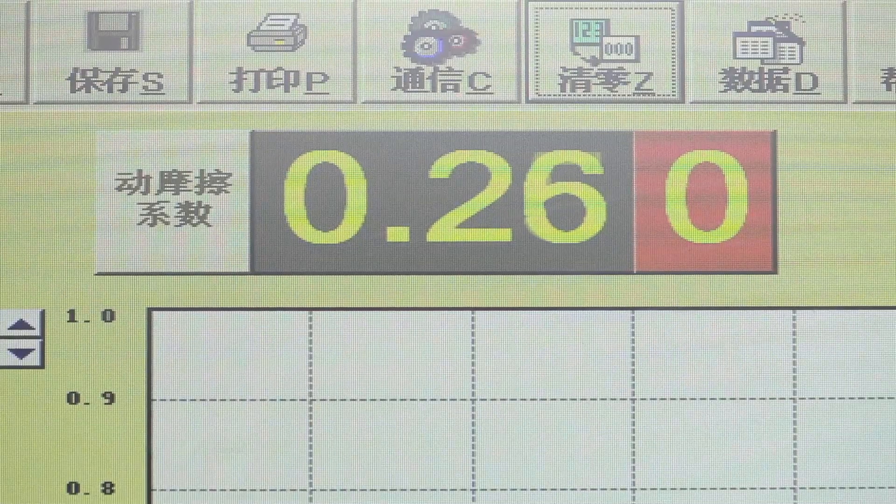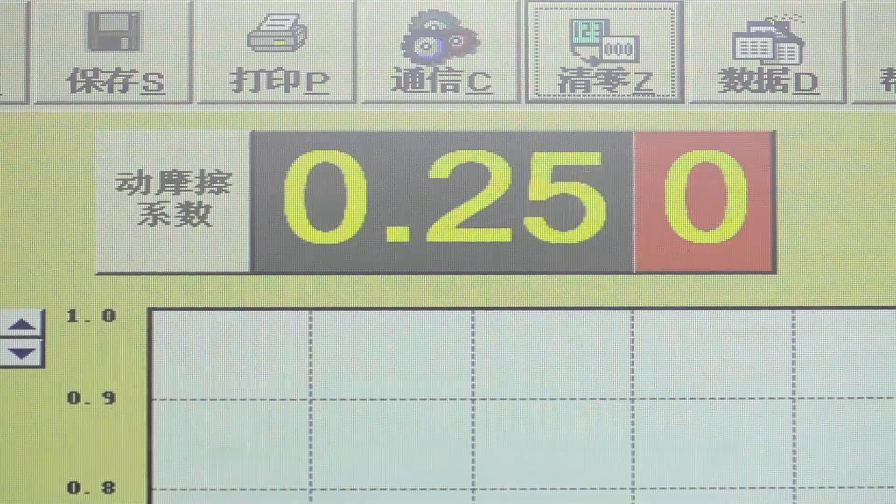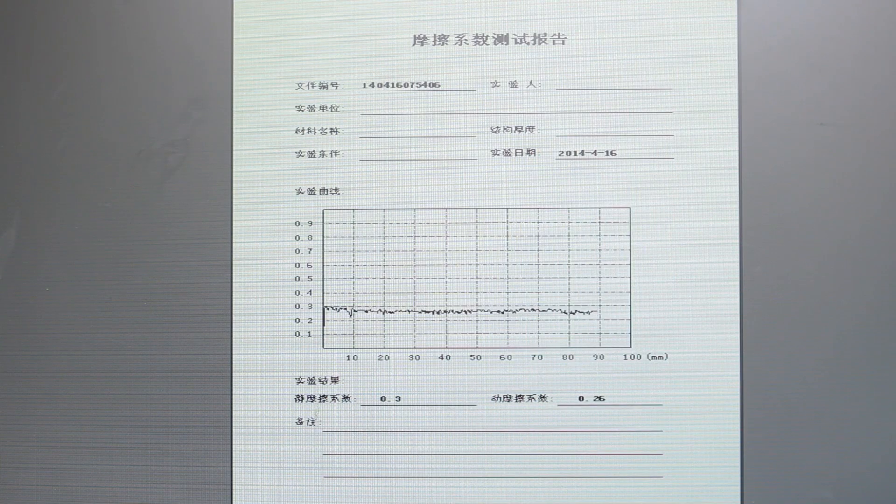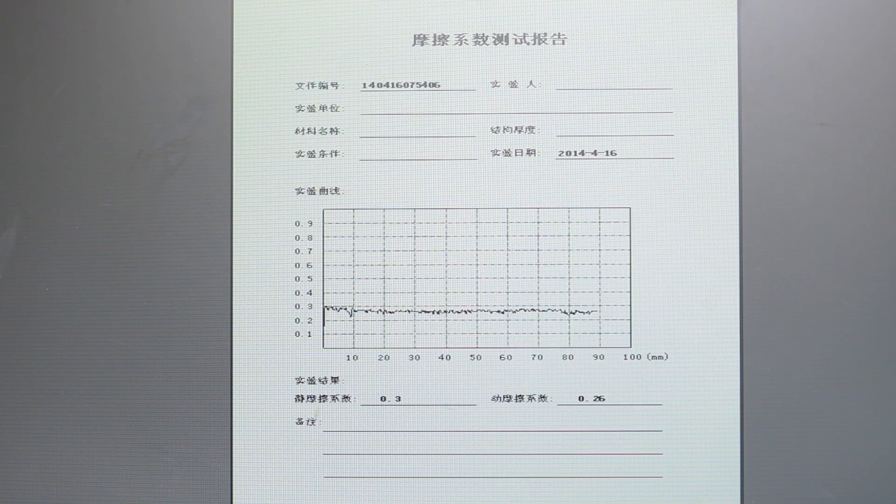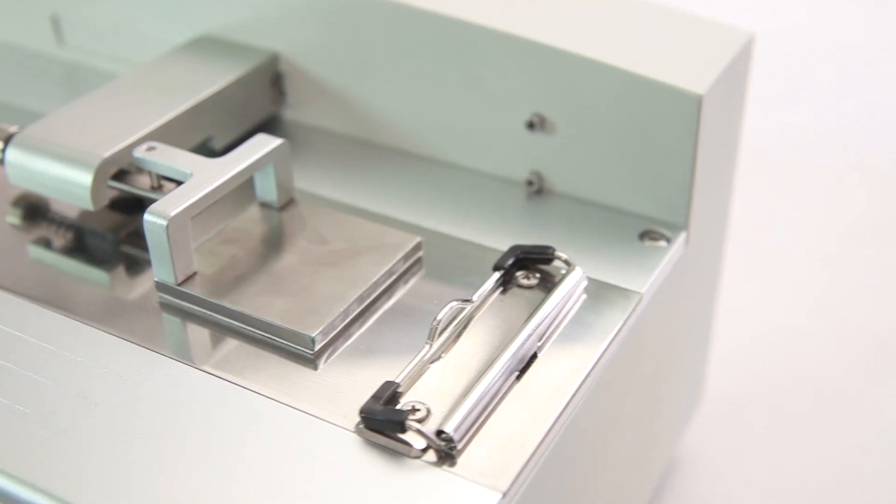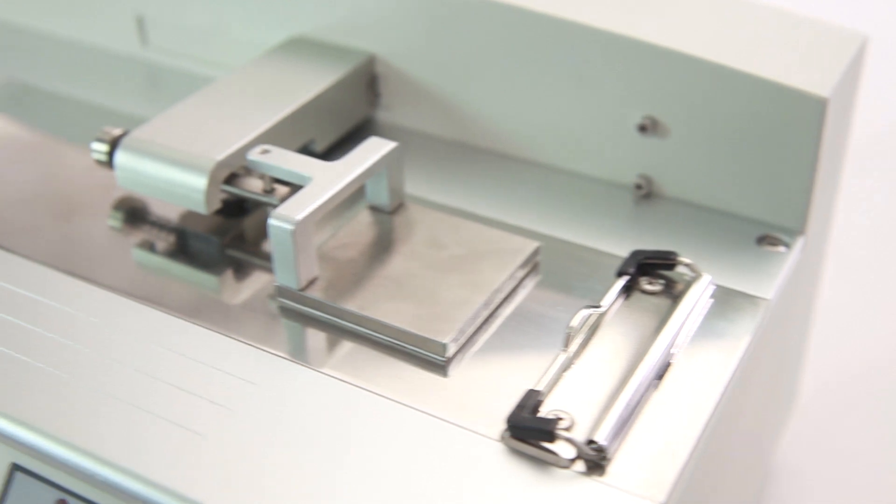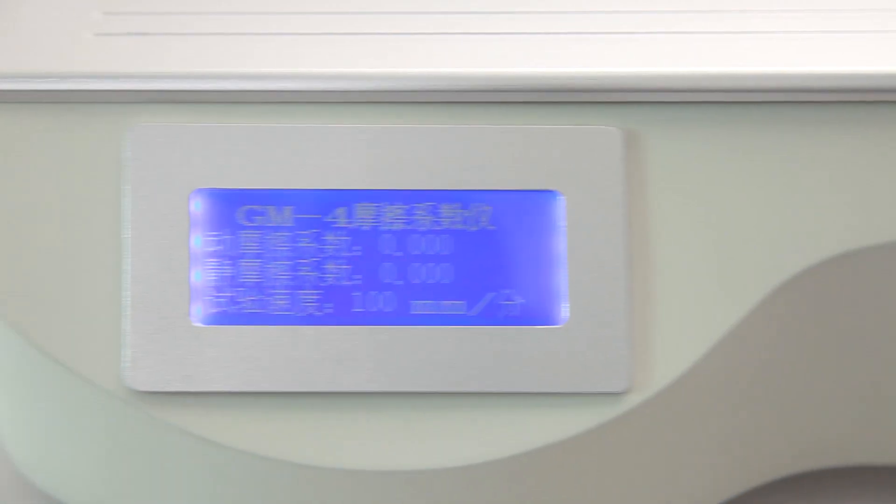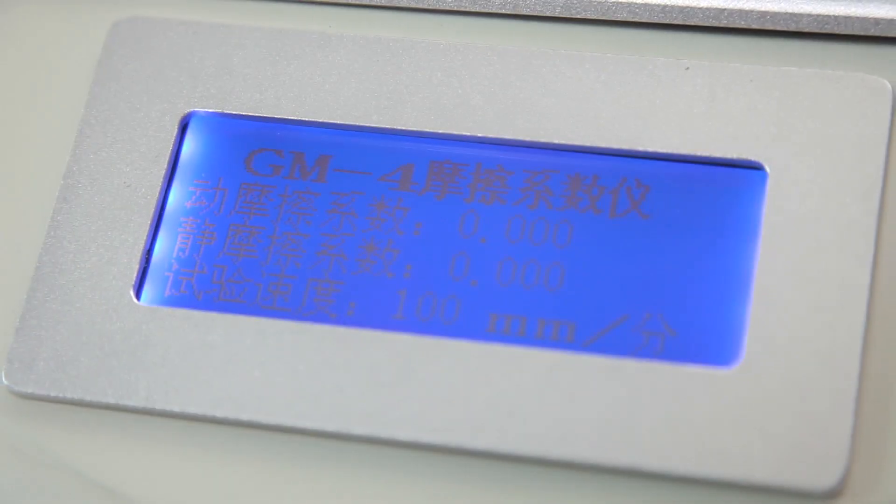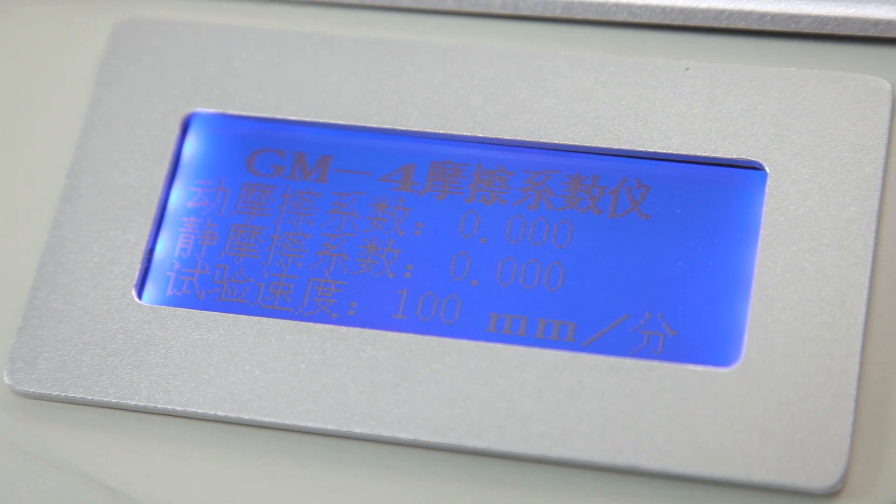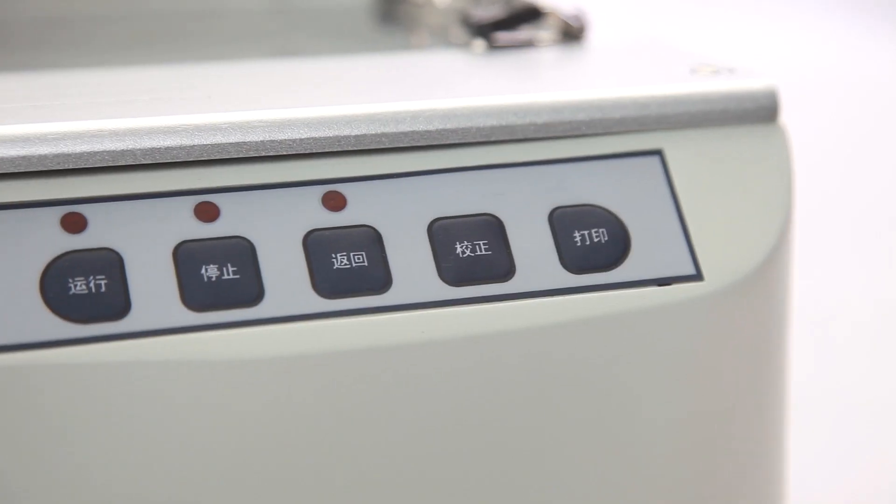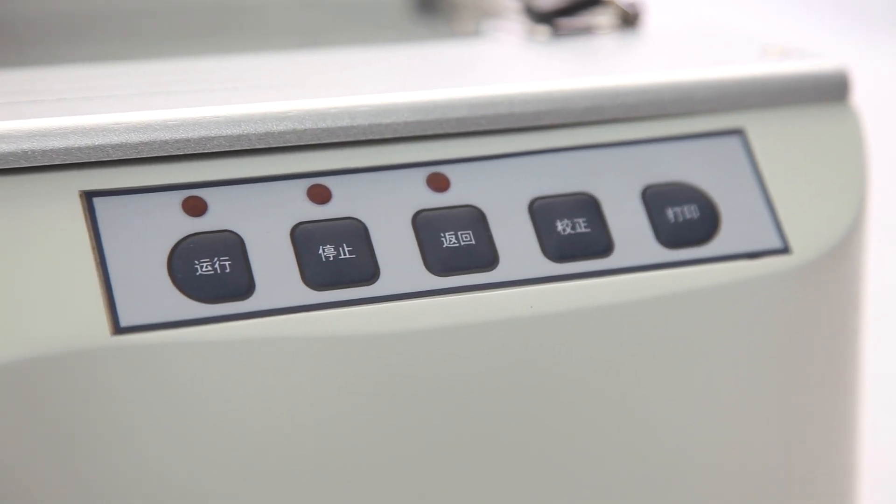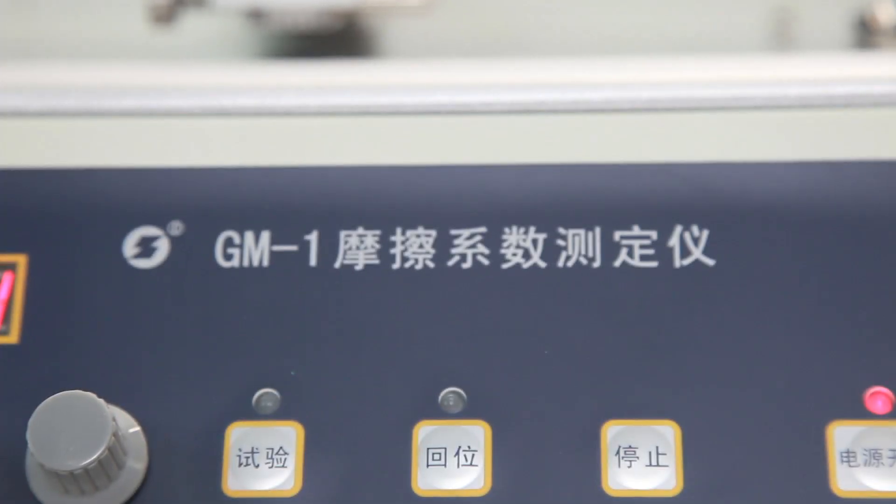Tester range is 0.001 to 0.999. It uses imported high-quality core parts with high precision, high performance and long life, and can extend temperature control function. GBPI, the overall program of packaging-tested technology.